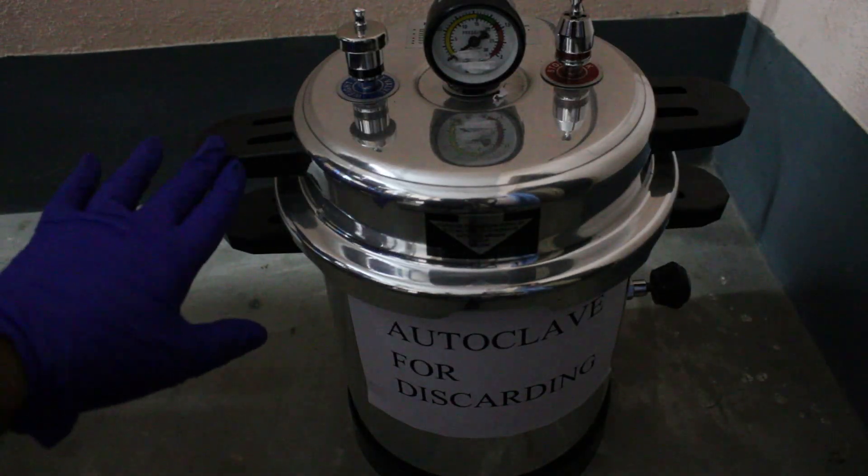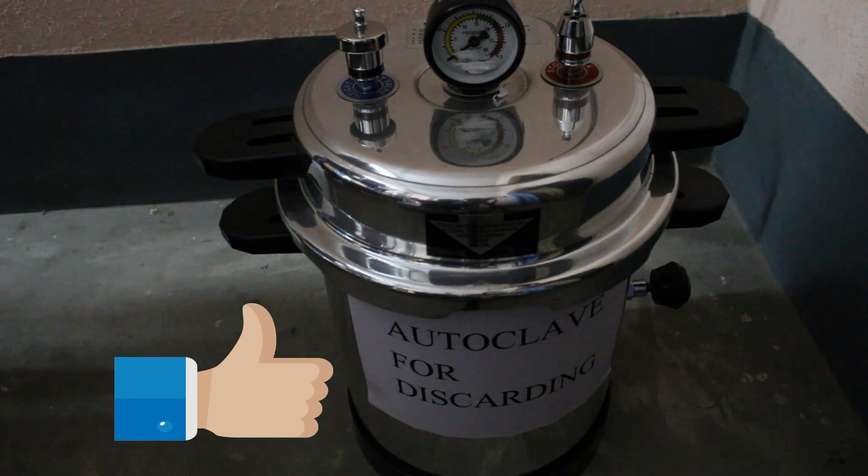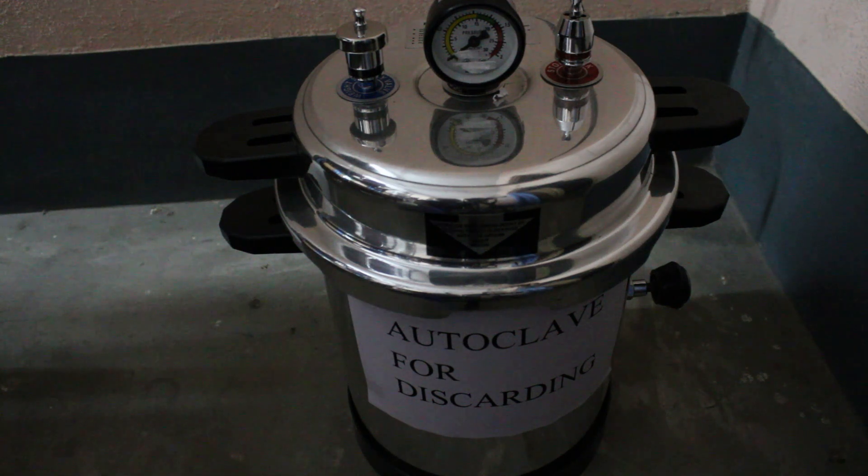After everything is done, turn on the machine and follow the instructions same as operating an autoclave machine in general. If you have any queries you can check my other videos where I have shown how to operate an autoclave. This is how we do discarding of contaminated materials in flasks and petri dishes inside an autoclave machine.